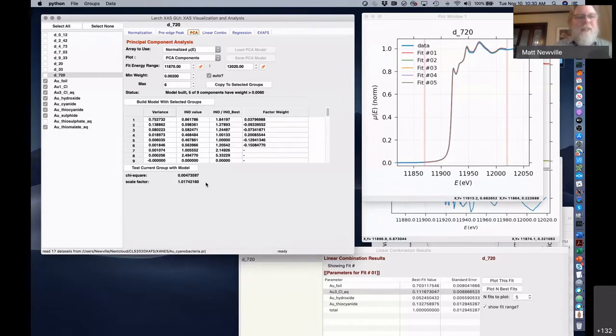But that gets into the weeds of whether you're doing ICA or PCA or other methodologies for how to do component analyses. But basically, yes.